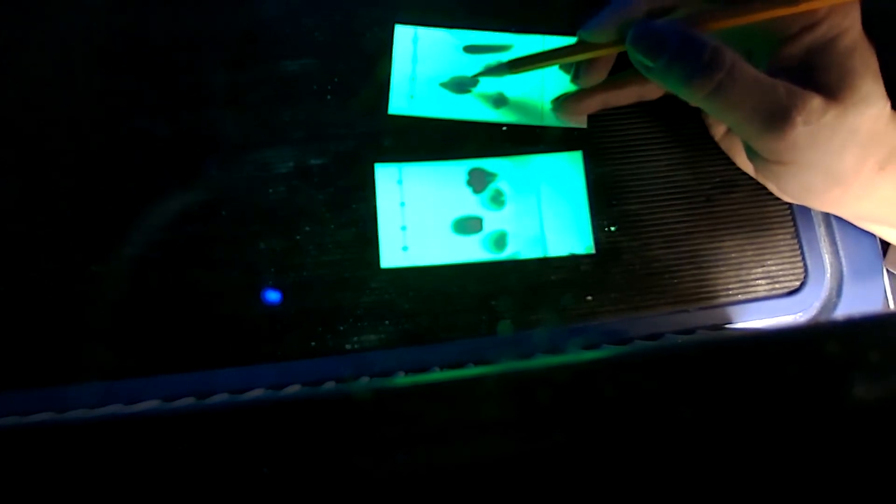Okay, now we have both plates under the UV light and you could see that, if you remember when I said we don't want like a big drop, you see when you have like a big drop it's going to show, you know, a bigger spot and it would make it harder for us to calculate or measure the distance.